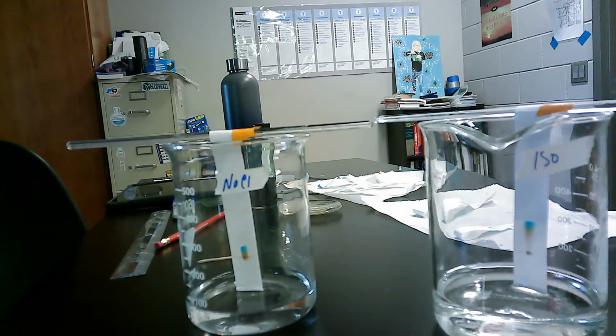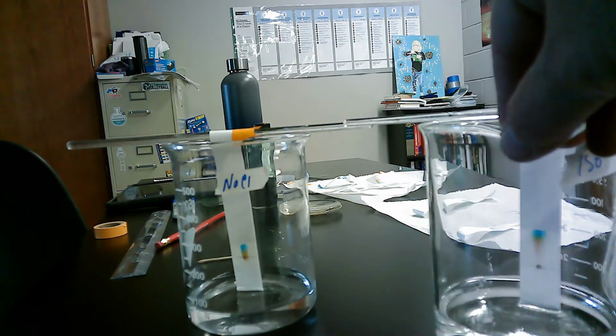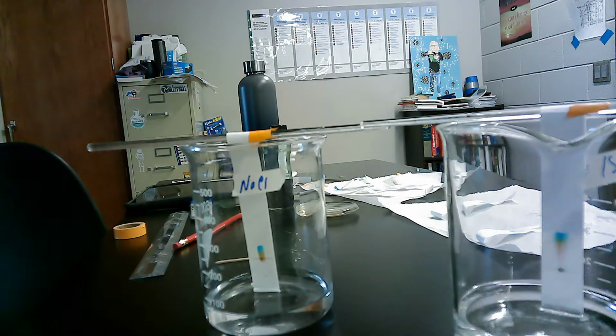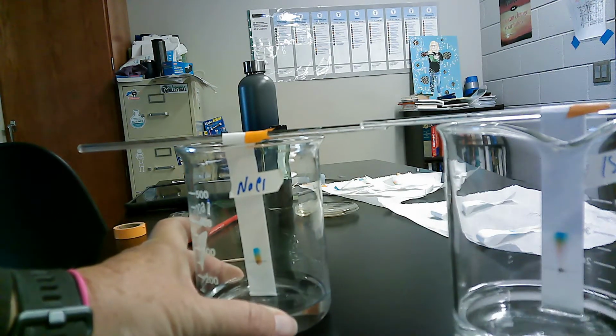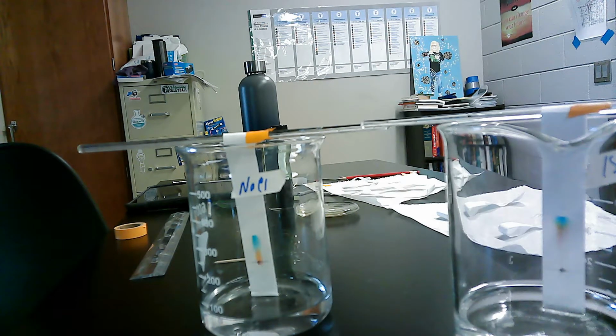So now we're back, and you can see that both of them are progressing. The NaCl is a little bit farther behind only because I started that one second. You can see the isopropyl alcohol a little bit farther along, but they're both changing. So we'll let them go for a little bit. Pause it, come back again. Okay, a little time lapse. You can see again the progress that we're making.